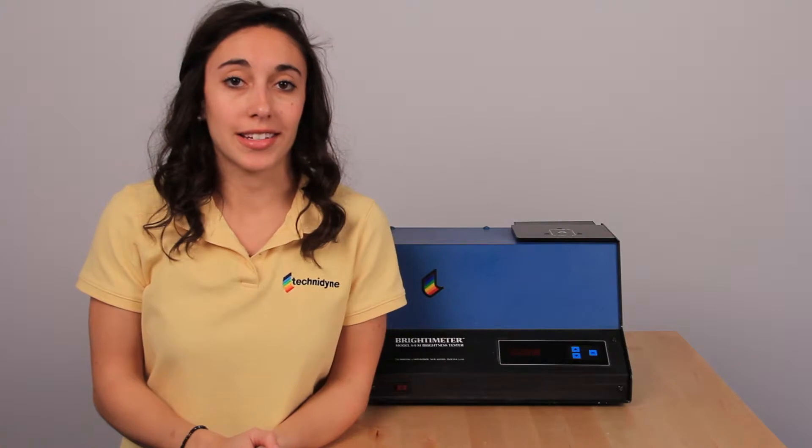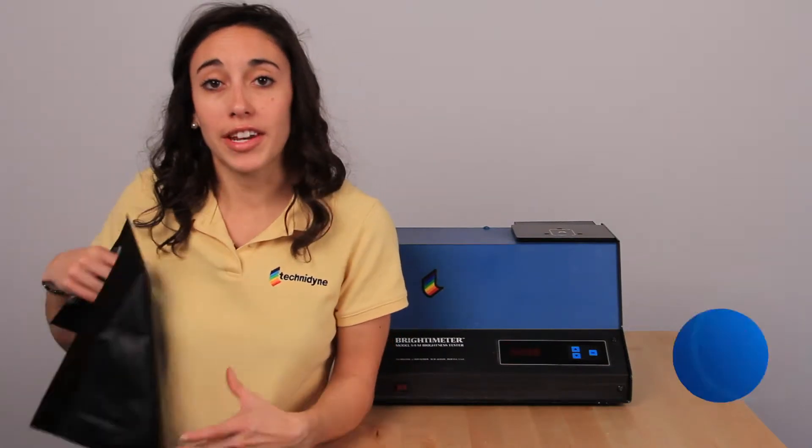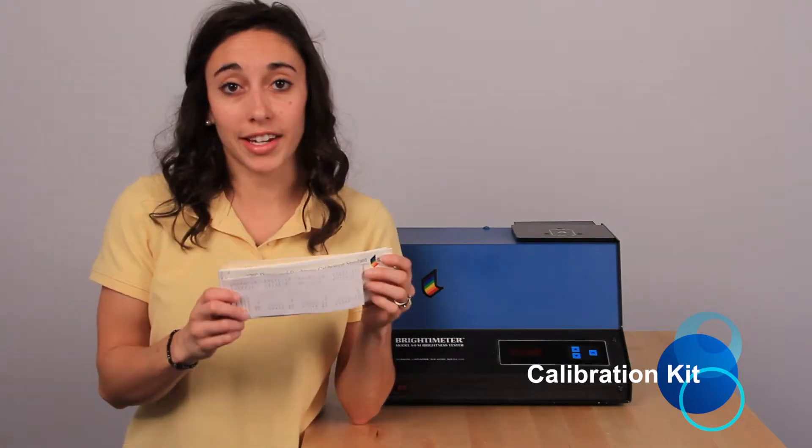Today we're going to talk about Technidyne's S4M Brightimeter, but before we can get started with our calibration, we need to make sure that we have everything on hand that we'll need. The first thing that you should have is your calibration kit. Inside that calibration kit, you'll find five sets of calibration standards.